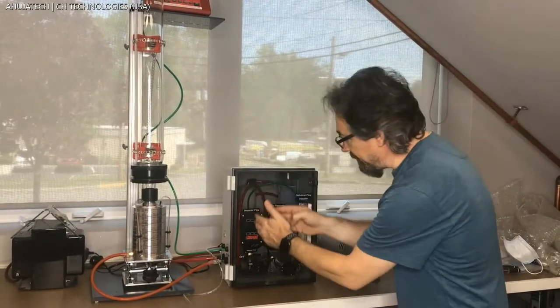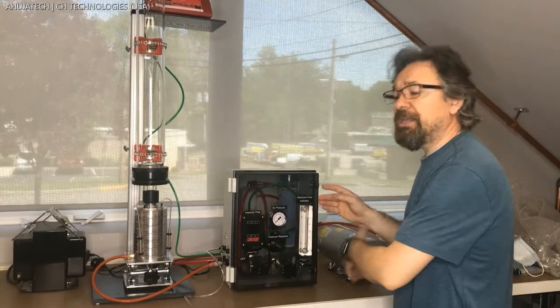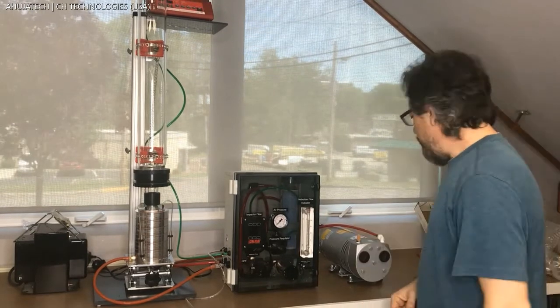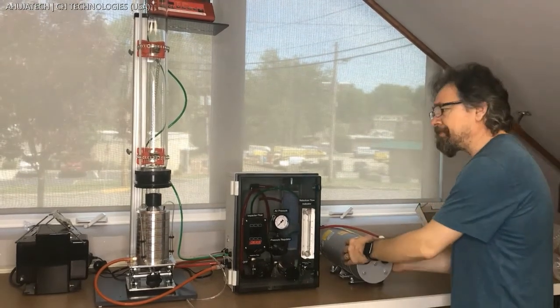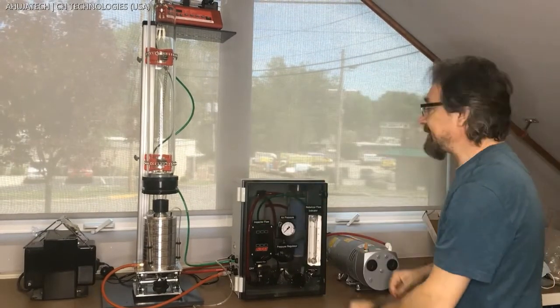The exhaust first goes to a HEPA filter and then through a dryer filled with desiccant, which can be regenerated in an oven to be reused. To the right is the vacuum pump that drives the whole setup.